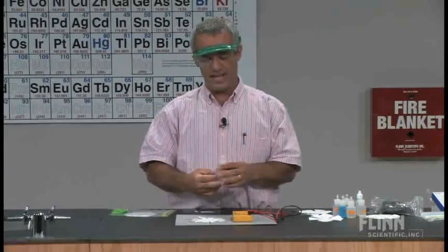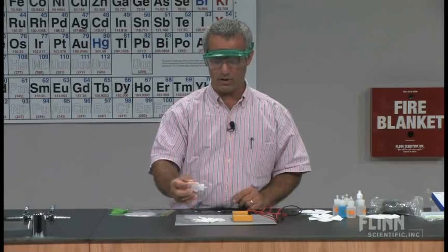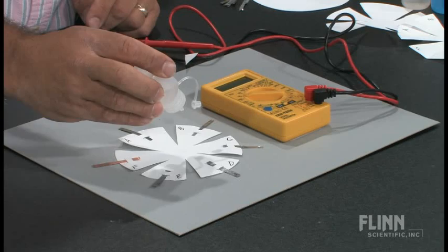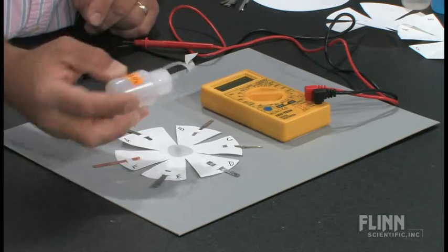You can simplify that quite a bit and go with much smaller quantities. These are all one molar solution. Here's my potassium nitrate, which is going to be the salt bridge in the middle. I'll put one, two, three, four, five drops of that.